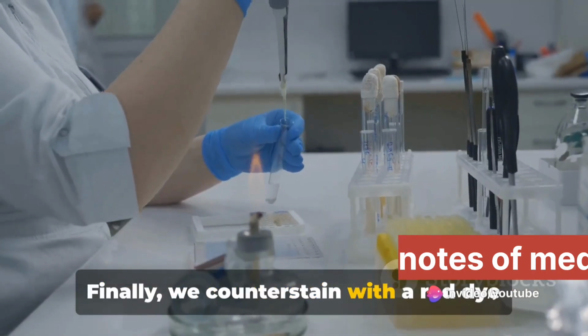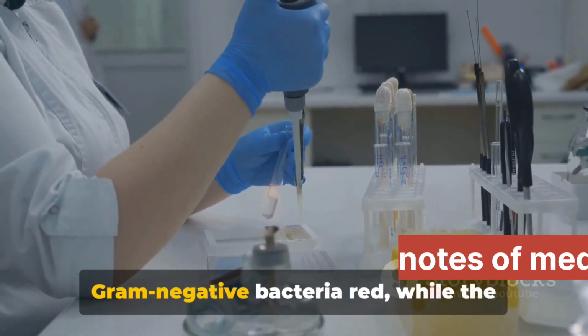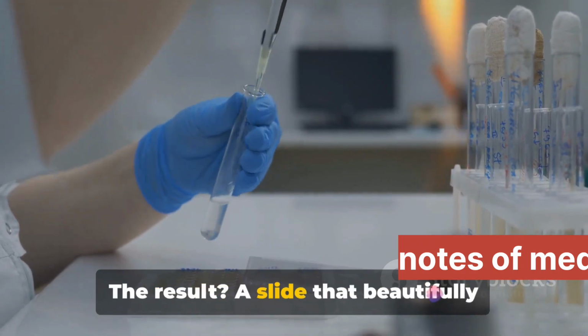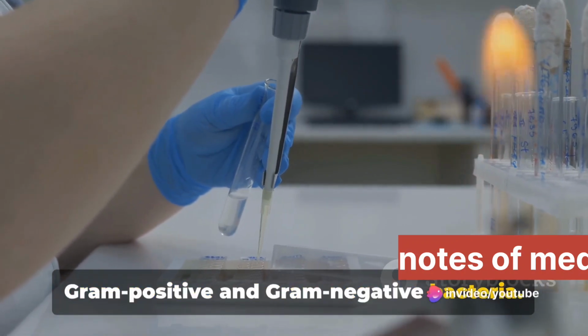Finally, we counterstain with a red dye called safranin. This step colors the decolorized gram-negative bacteria red, while the gram-positive bacteria remain purple. The result? A slide that beautifully illustrates the difference between gram-positive and gram-negative bacteria.